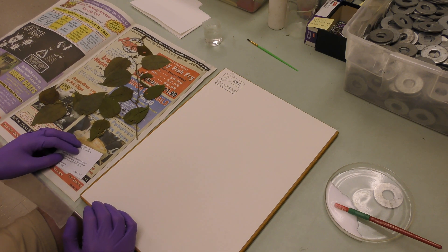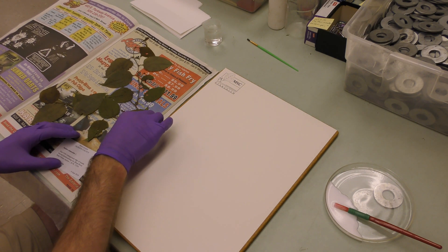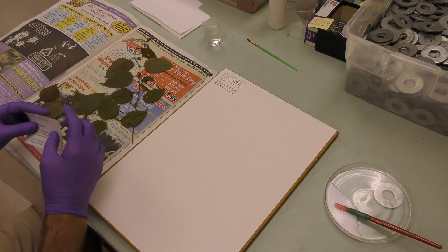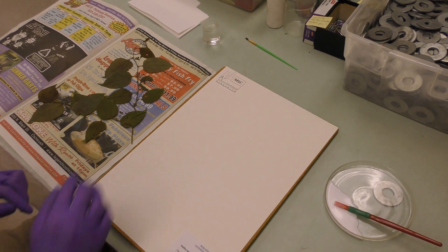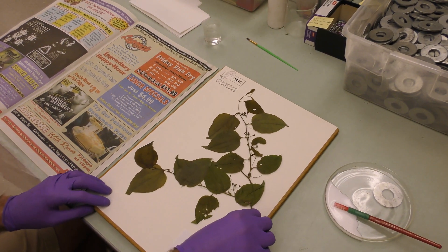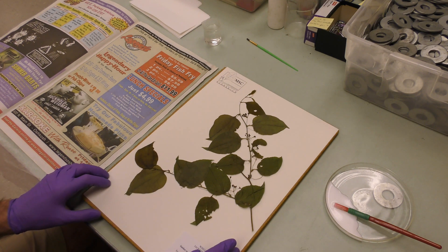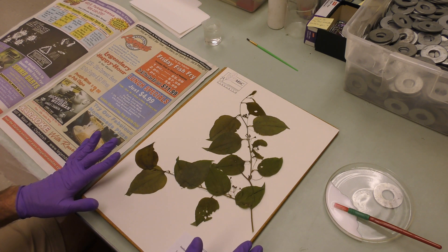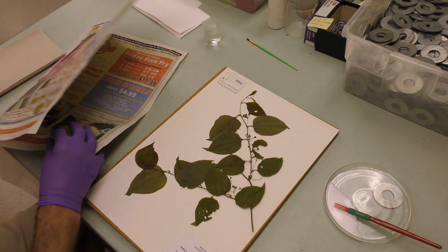This is kind of how we receive specimens when people send them to us. The first thing I'm going to do is arrange all the pieces on the herbarium sheet. The reason I want to do that before I start gluing is because I don't want a bunch of stuff overlapping — like I don't want this plant material overlapping the label. Luckily this is a pretty easy one. I'm going to show you a harder example after I'm done with this.